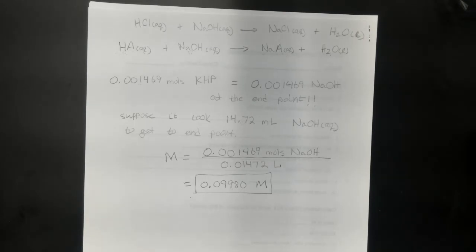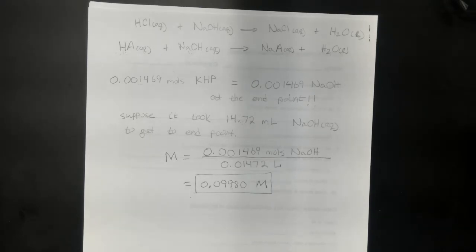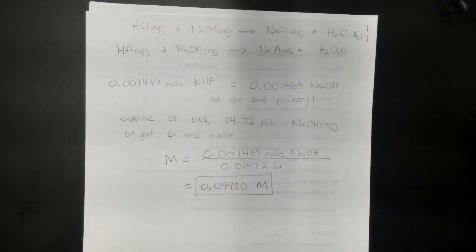And so what you think is all sodium hydroxide, if you were to attempt to make a solution of this concentration, is not, in fact. And so your preparation of the solution would be wrong. You would calculate this as being the correct concentration perhaps, but actually it'd be a little bit less than this concentration, right? Because the mass you weighed, not all of it is sodium hydroxide. Anyway, this is one of the reasons why sodium hydroxide solutions have to be standardized. And this first step is a standardization of sodium hydroxide.